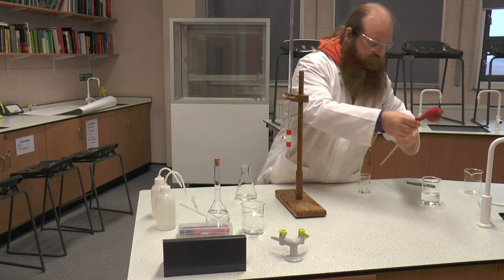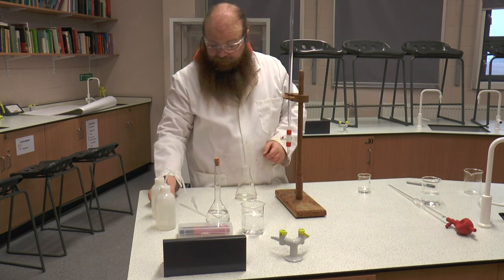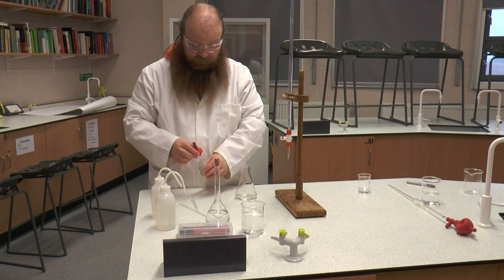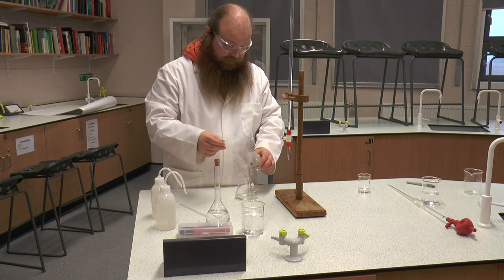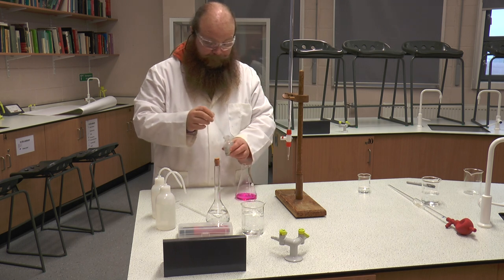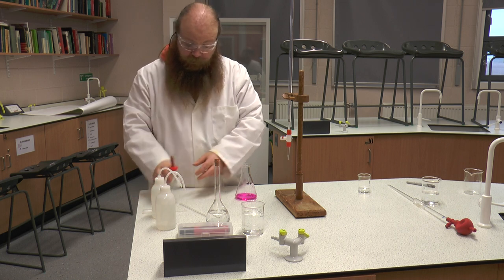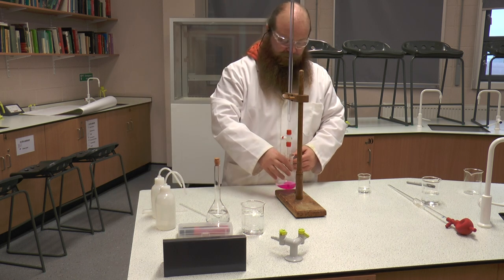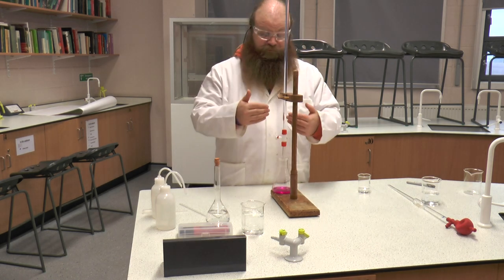Put our glassware aside, making sure that it is not able to roll off the edge of the bench. We are going to add again about five drops of phenolphthalein, our indicator, making sure not to get it everywhere. We check that we have sufficient clearance again for us to be able to do the titration, and then repeat.